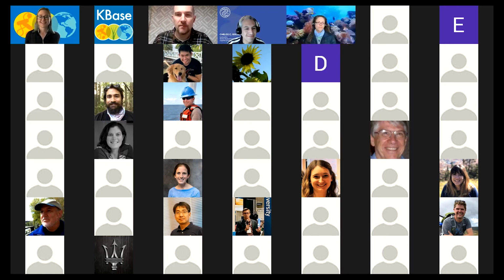There was also some great information associated with each of the apps on what it's using, and a little bit of the background. For the students that really got into using KBase, I was seeing that many of them were using, I apologize, I don't remember the name of the specific tab. It might be the info tab that talks about the app and the different analyses that it's running. There was a lot of information in there that could help the students understand what parameters they may want to set and why they're setting them.